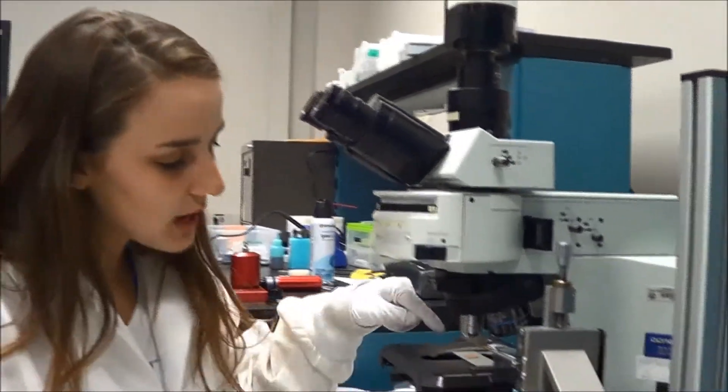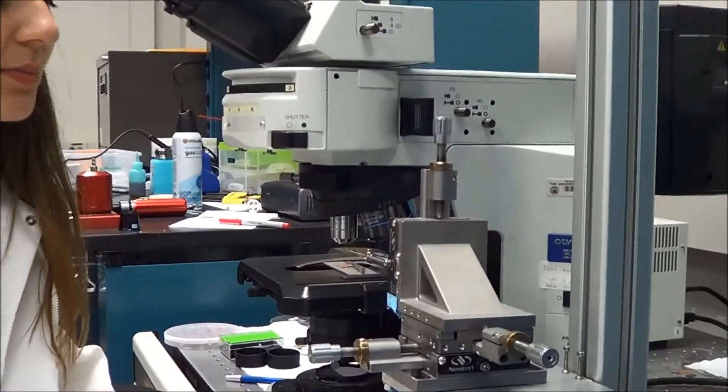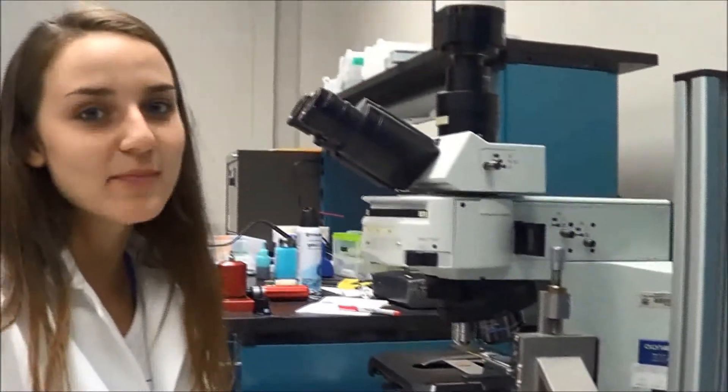Next step is heterostructure fabrication. Using our micro-manipulator, we can use the microscope to observe which flake we want to pick up, use this sharp tungsten tip to lift off the WSE2 flake and place it on top of our MOSE2 flake.